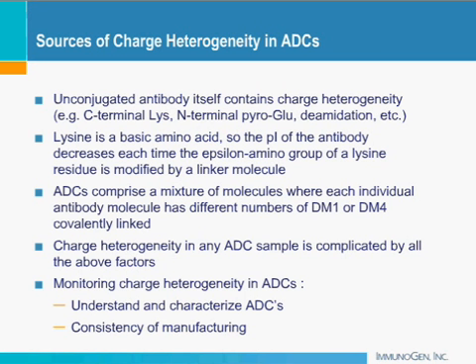So carrier ampholyte composition is one of the considerations that you need to look at when you're doing method development. Here we see how sometimes you may require additives in your sample prep. Here we have an example of a conjugate that was analyzed without any urea in the sample prep. You see in the electropherogram that there's a lot of precipitation and noise in the profile, and there's hardly any charge-based separation.